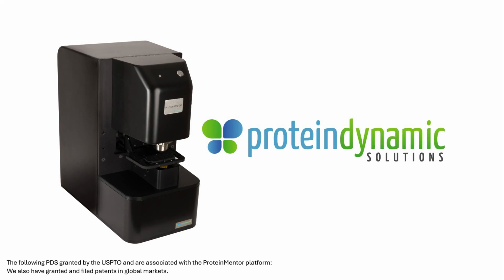Protein Dynamic Solutions continues its efforts to provide the advantages of our system for the biopharma industry, in the form of a series of videos demonstrating the capabilities of our ProteinMentor platform technology. ProteinMentor is a benchtop instrument that is cloud-ready with minimal cost of operations, requiring only dry air purge.